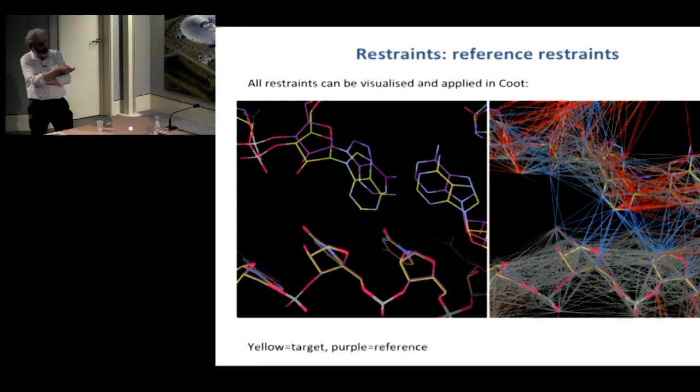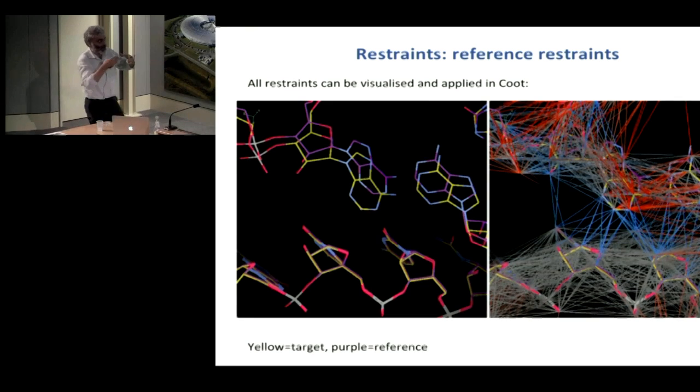And at the end, what will happen is that interatomic distances, in this particular case between nitrogen and oxygen, will be similar to those between nitrogen and oxygen from the reference structure. It means that locally these structures will be similar. If you use this type of restraints, you may have global conformational changes. However, locally structures will be similar. I hope it makes sense.